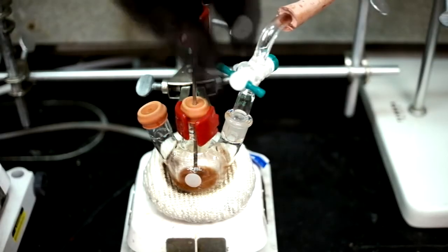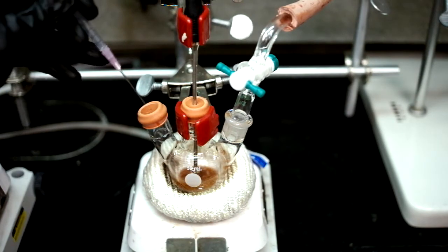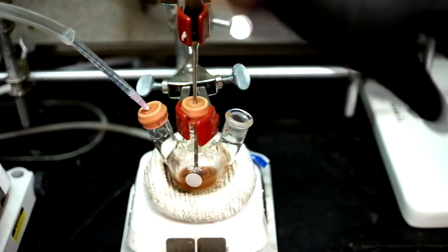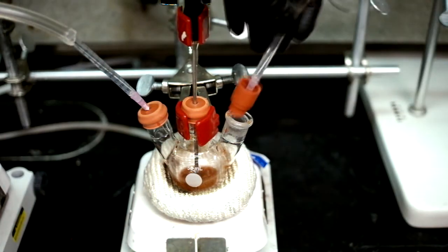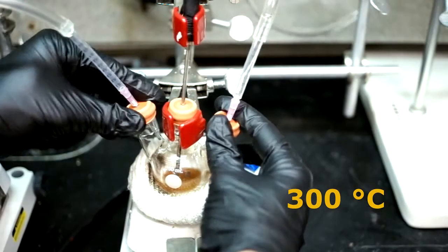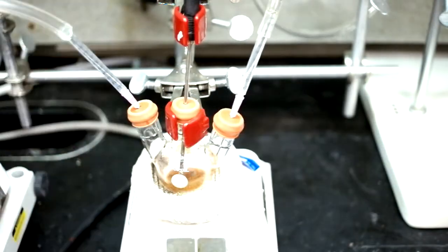After degassing, we can take the cadmium flask and put one argon needle in to fill the flask with argon. We can then remove the vacuum and replace it with an exhaust needle. We'll then heat this flask up to 300 degrees or until the cadmium is dissolved and we're left with a clear solution.